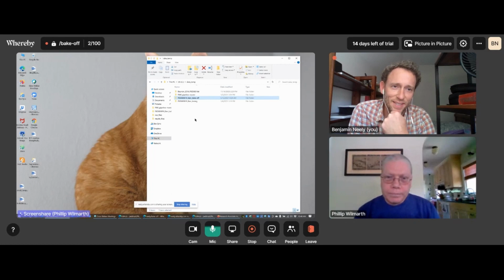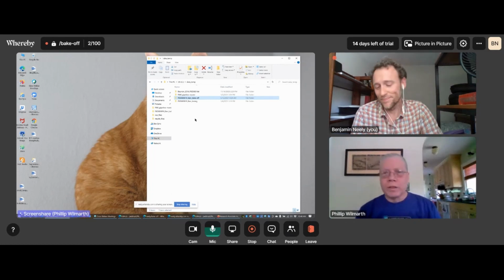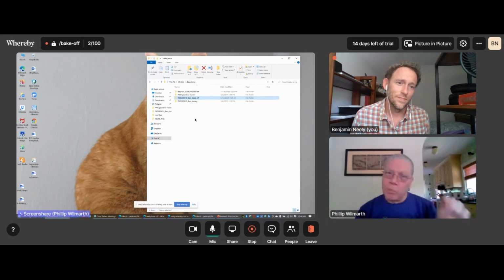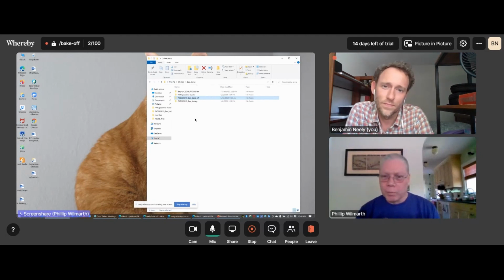Oh, so you won't have to change it to folder 3.02 or something. Right. So the script just points to the batch file, the Windows batch file, and the Windows batch file points to the actual executable for MS Convert. So then when you want to change to a different version of MS Convert, you just change the Windows batch file pointer. That way you decouple.